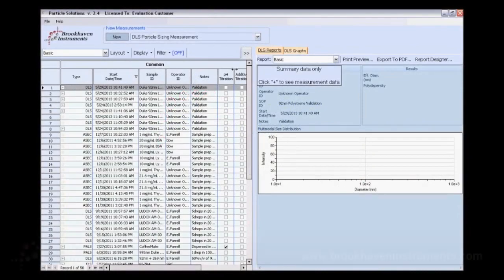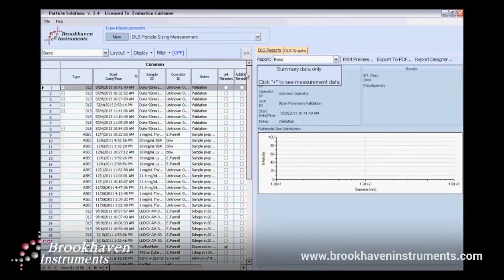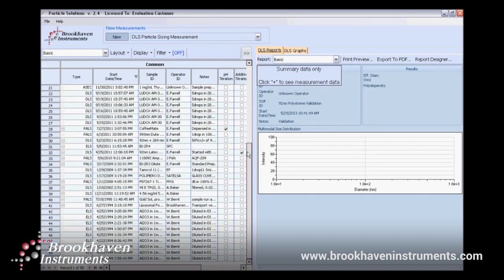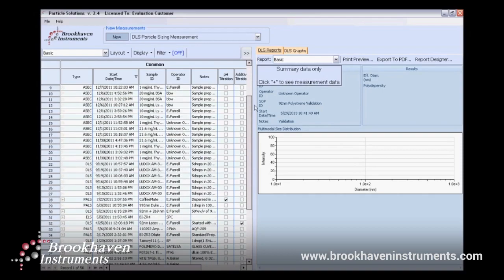Hello and welcome. I'm going to demonstrate the ease of use of Brookhaven ZetaPals instrument with Particle Solutions software.